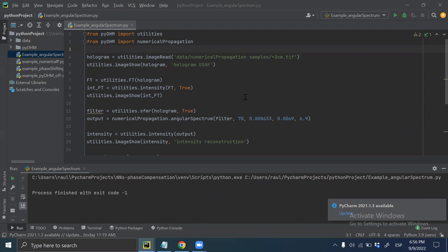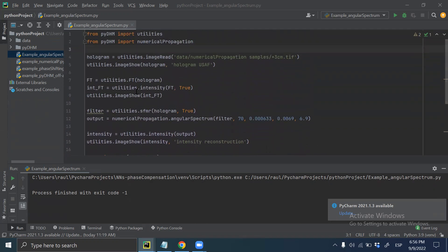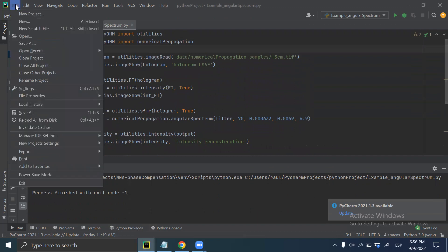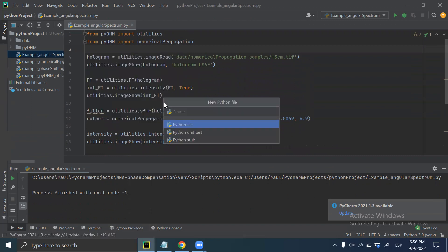I am using PyCharm to develop my Python project. This is the code that we want to create, but I want to show you from the beginning. The first step is to create the Python file. We need a name — for instance, 'sample_angular_spectrum'.